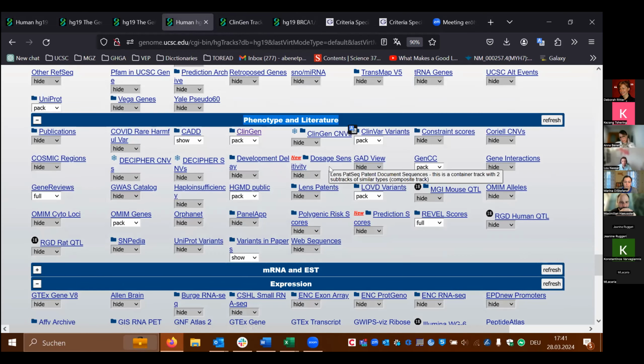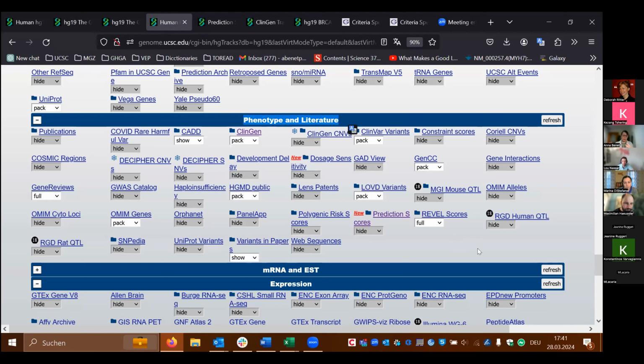And it's also up to you. If you want a special data set there, and this data set is available and open source, we will just put it there. I mean, it's important to know what the users need, right?